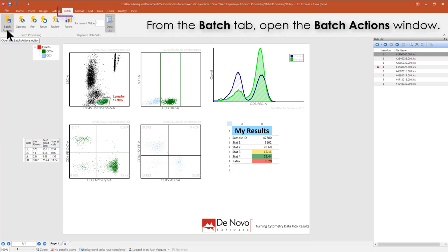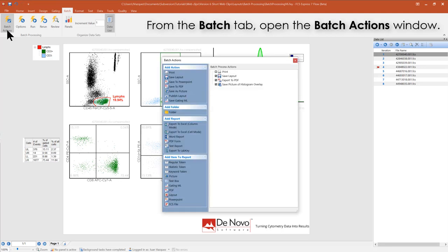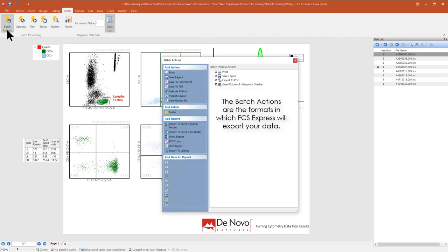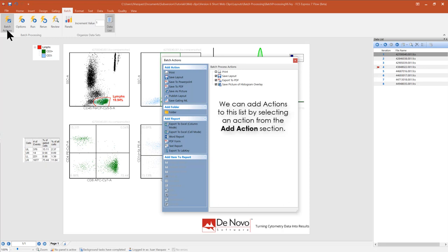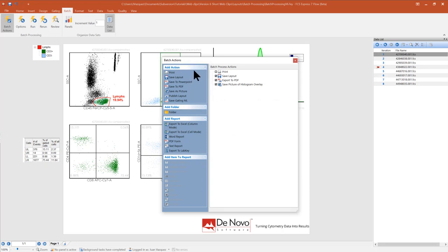From the Batch tab, open the Batch Actions window. The Batch Actions are the formats in which FCS Express will export your data. You can add actions to this list by selecting an action from the Add Actions section. You can select an action and then format the properties for that action.